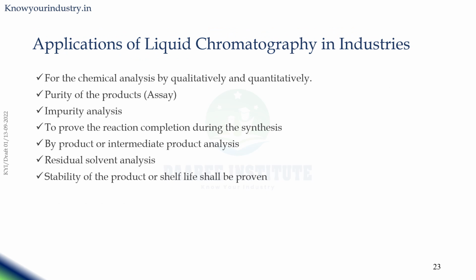Now coming to the applications of liquid chromatography in industries, including pharmaceutical or non-pharmaceutical industries, chemical industries, and agriculture industries. That includes chemical analysis of a qualitative and quantitative nature. You can identify the compound, and you can quantify the compound in a particular method, adopting liquid chromatography.